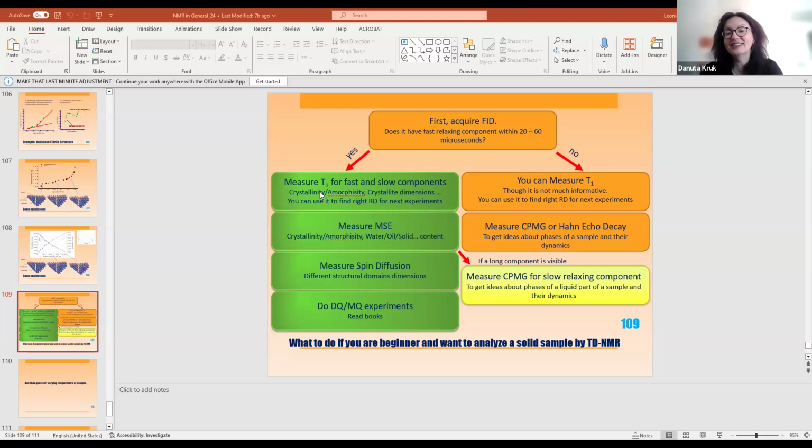Are you sarcastic? No, really. The probe can catch fluorine, but you know the pulses and all the tuning. The system is tuned about 1.5 megahertz outside. So if you are getting a fluorine signal, this is really great.